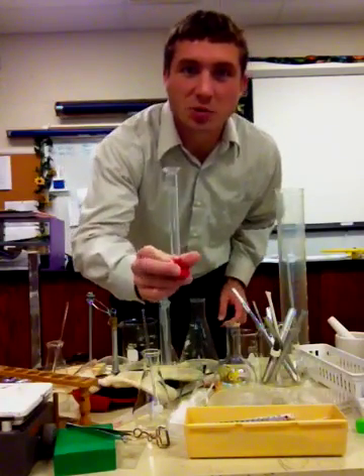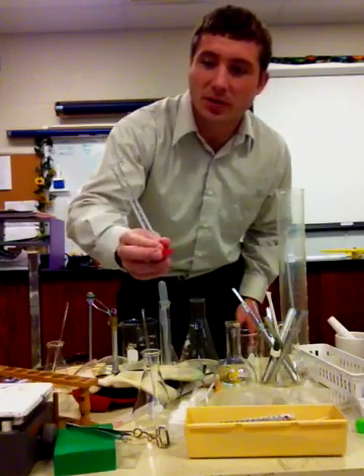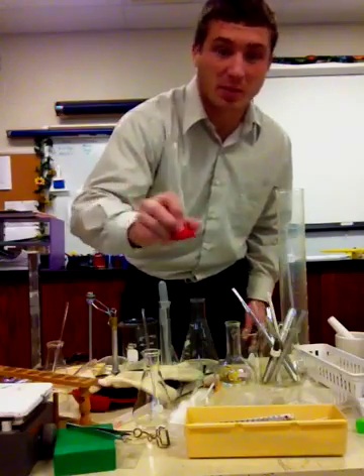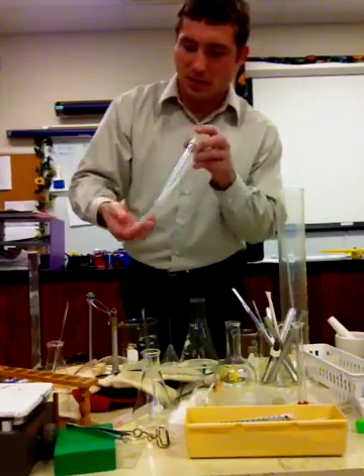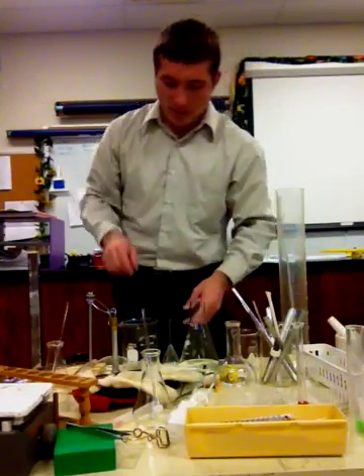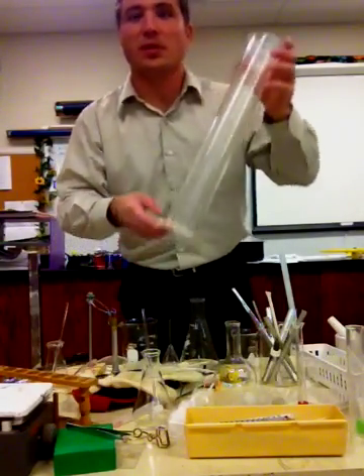Here is a graduated cylinder. This is a very small one for measuring very small amounts — we can use it to measure volume, and it is labeled in milliliters. This one is 10 milliliters. We can move up to a 50 milliliter one, and even a larger one — this gigantic one can measure up to 1,000 milliliters.